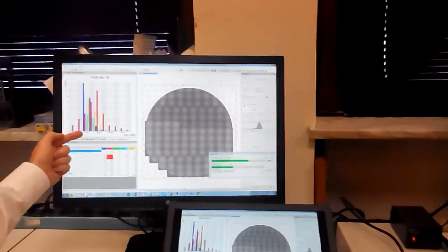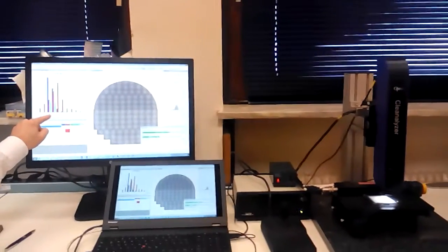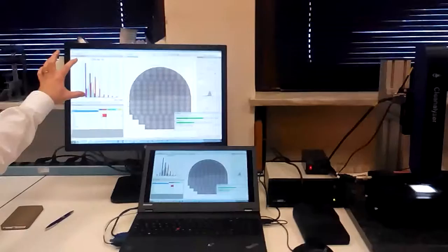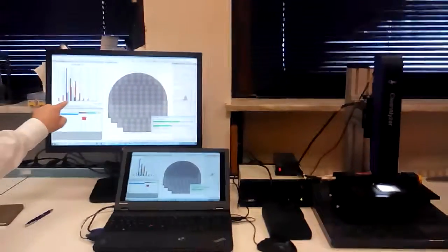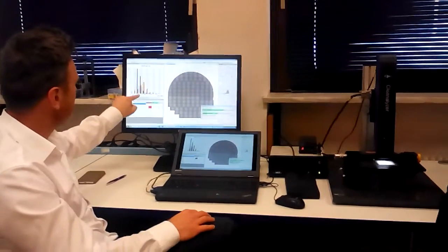We've got a failure straight away on VDA-BD19. On the 25 to 50 micron counts, we've way exceeded that, so this would be a failure straight away. So it's really working very, very well. Also now you can see that we've got a class failure here, and also a bit of a population appearing on 100 to 150.